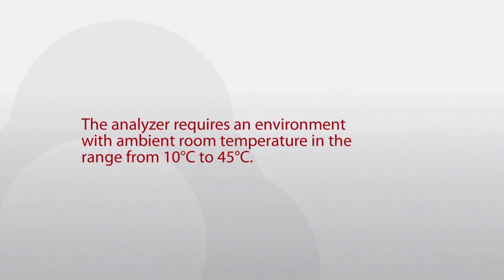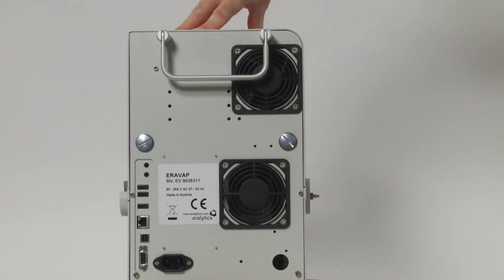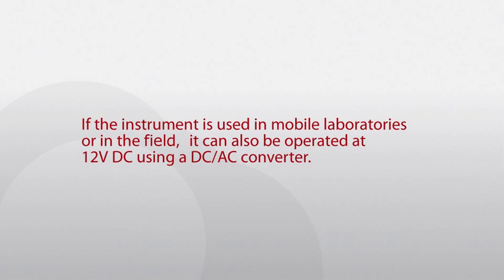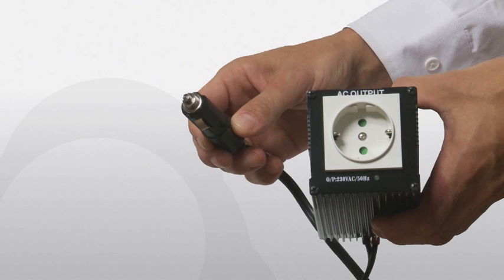The analyzer requires an environment with ambient room temperature in the range from 10 to 45 degrees Celsius. Turn the instrument and connect the power cable to the plug on the rear side of the instrument. The AC input voltage can be anywhere between 85 and 264 volts. If the instrument is used in mobile laboratories or in the field, it can also be operated at 12 volts DC using a DC-AC converter.